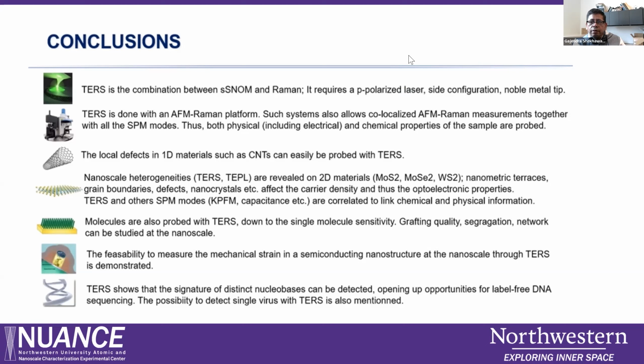I have a small question, GS. So when you said the minimum resolution of TERS is a few nanometers, is it possible to look into point defects or something? I know it's a high bar, but.